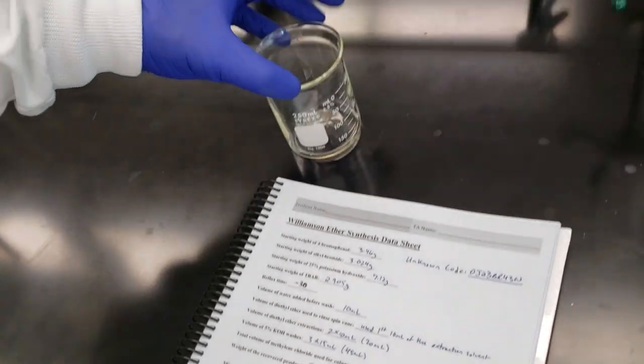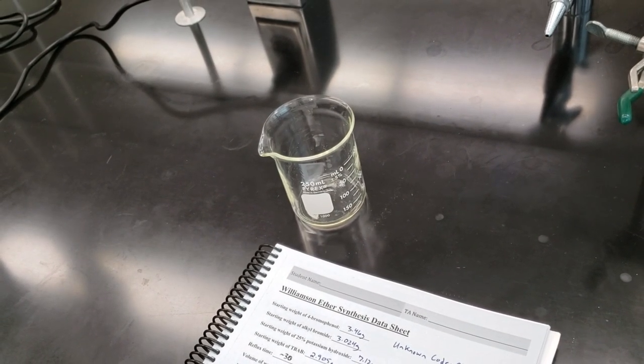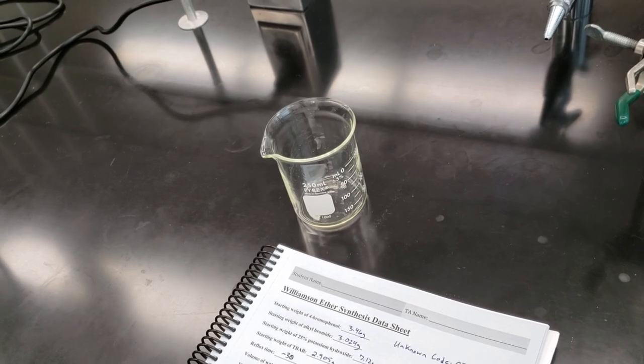So we're going to take this beaker over to our IR and our NMR, characterize our final product so we can determine what our starting unknown alkyl bromide was.